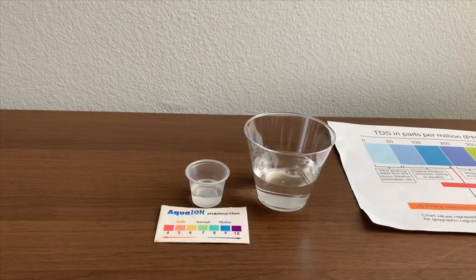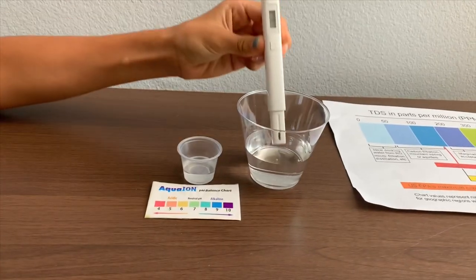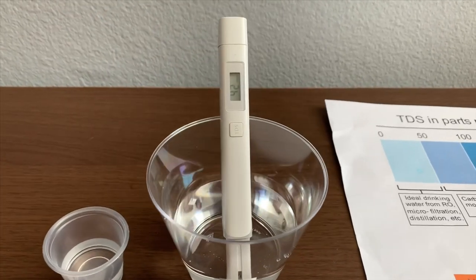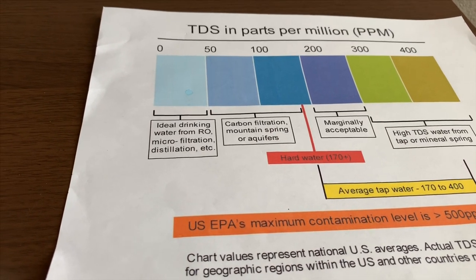We're going to test the TDS level first. Turn on the TDS tester and make sure it says zero. Put it in and let's float. 41 — that is micro filtered water.